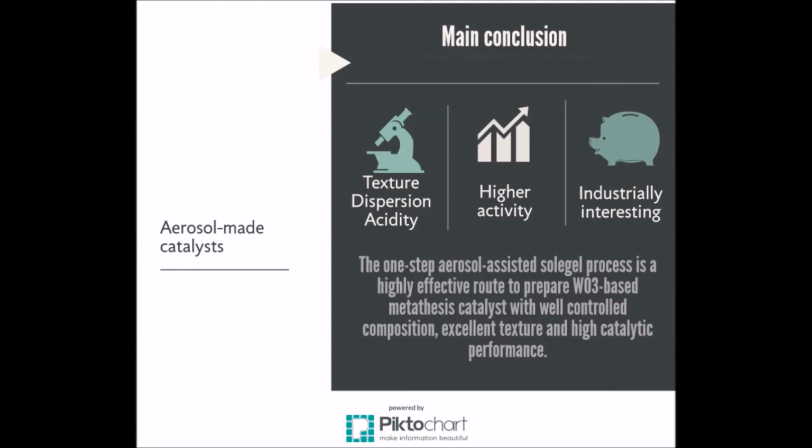If you go to the paper, you will see all the details, but just the main conclusion of the work is that by working with this aerosol method, we get samples with very interesting texture, more than 500 square meters per gram. Dispersion of tungsten is excellent. We have higher activity as compared to reference catalysts, and this makes these catalysts relatively interesting for industrial purposes.